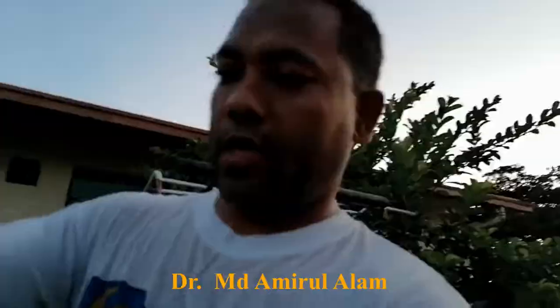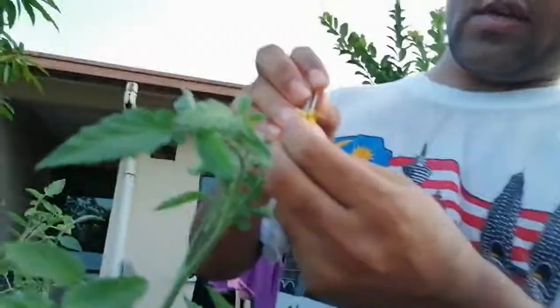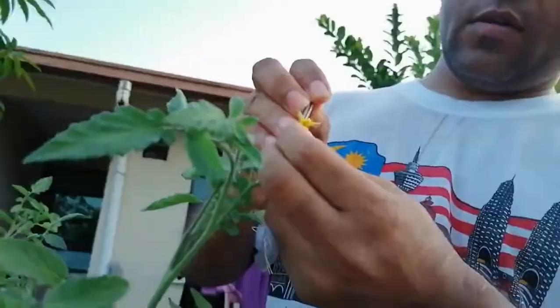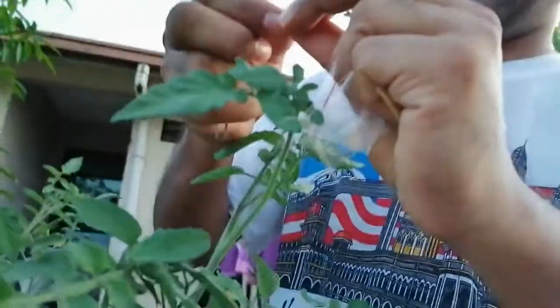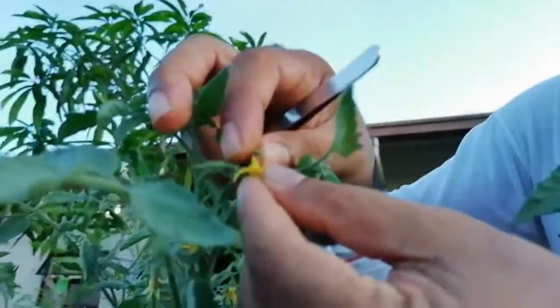The next morning, you open and remove the bag carefully. Those flowers will already be open. From that flower you have to bring the anther. When the flowers are fully open, you can touch the stigma with the anther for pollination.